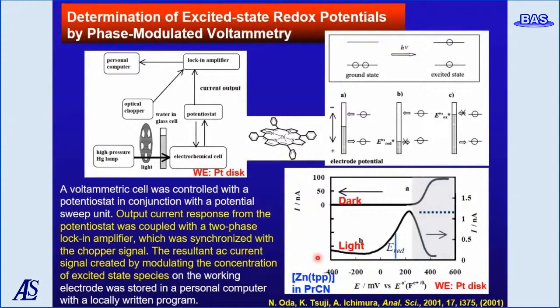The potential of the photoexcited molecule was measured using the phase modulation voltammetry technique because it is necessary to observe the electron transfer between the photoexcited state molecules and the electrode. Normally, excited molecules in the vicinity of a gold or platinum electrode are considered to be quenched by the electrode, but it has been found that photoelectron transfer reaction in the excited state can be observed when the lifetime of the excited state molecules is long enough.